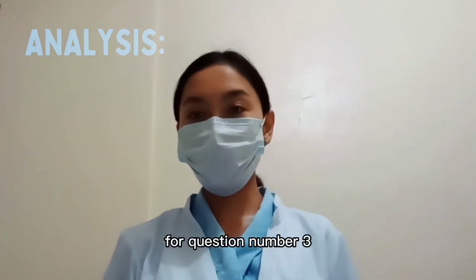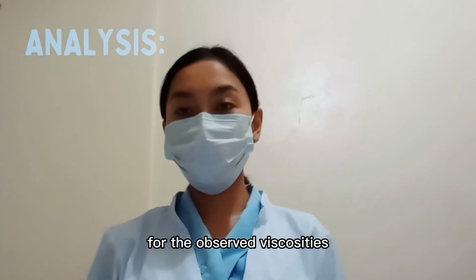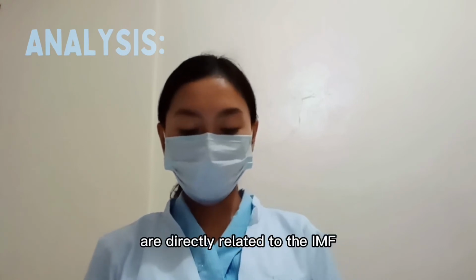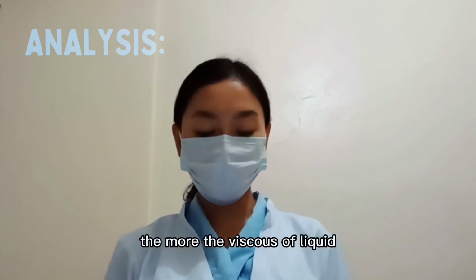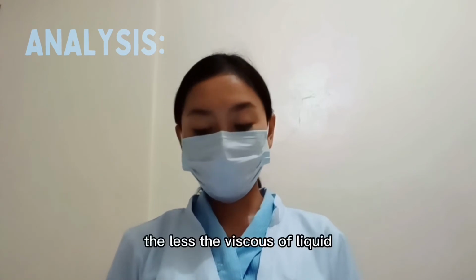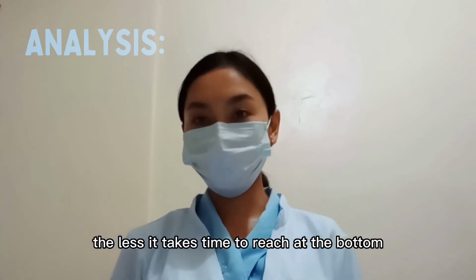For question number 3, what explanation can you give for the observed viscosities? The viscosity of the liquids is directly related to the IMF as well as the time. The more viscous a liquid is, the more time it takes to reach the bottom. The less viscous a liquid is, the less time it takes to reach the bottom.